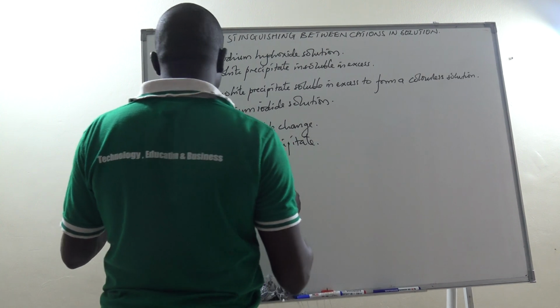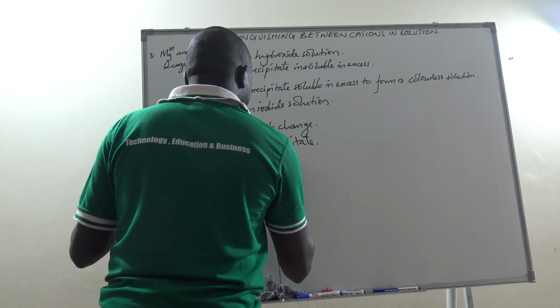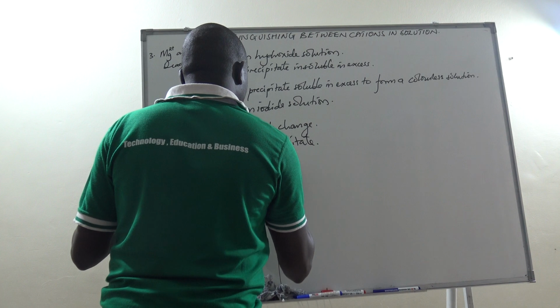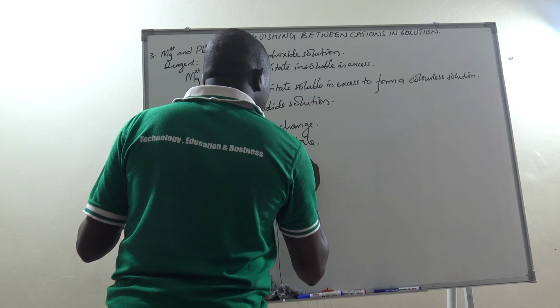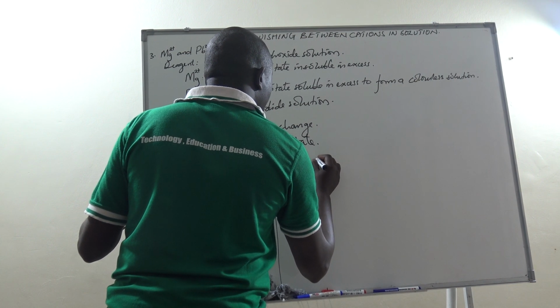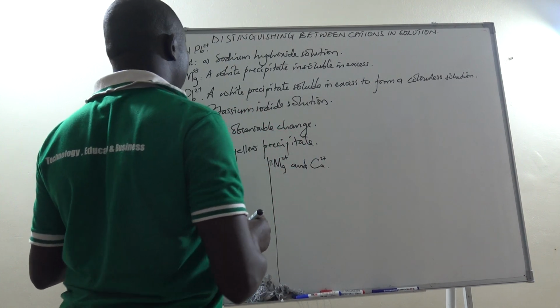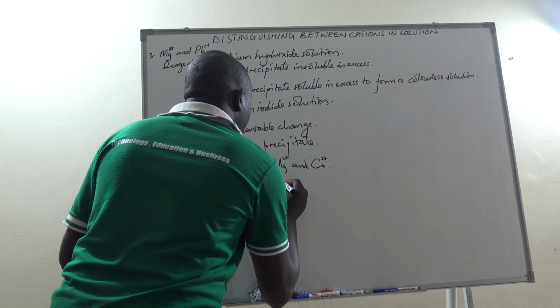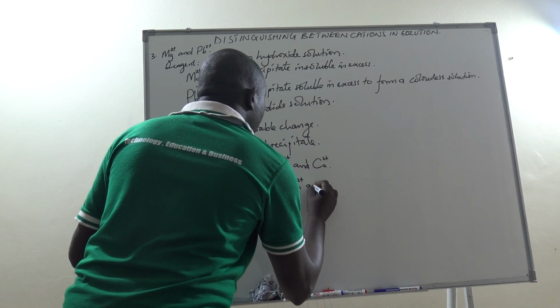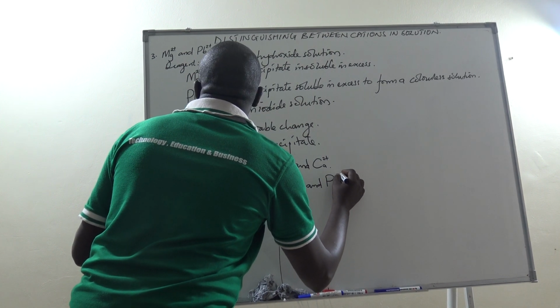Please also try distinguishing between magnesium ion, this one is now number 7, magnesium ion and the calcium ion. Please let me add you one more, that is zinc ion and the lead 2 ion.